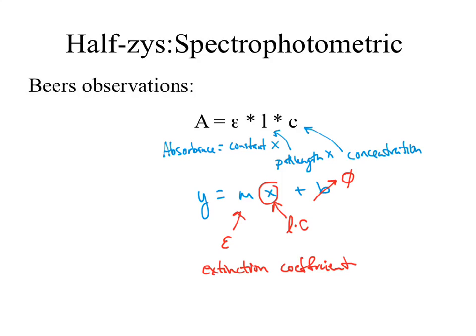How? You all read the procedure. What do you do? Take the sample, hold it up to the light, and say that roughly half of it is absorbed. Yes? No? How about 40% of it is absorbed? 30%? 10%? Our human eye does not quantify.